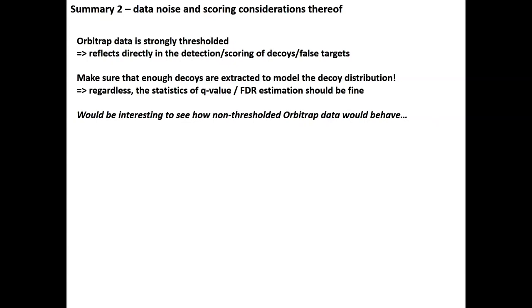I wanted to share with you, and I think everybody who has ever opened an Orbitrap data file can realize that the data is actually extremely worked out. I don't know if it's for good or for bad, but it definitely contains very, very little noise. And this will directly impact the performance of your scoring of your decoys and false targets. So if you open those pictures, also the ones from the tutorial tomorrow, you will see that the pictures will be very similar for the Q-Exactive as the one I showed you today.